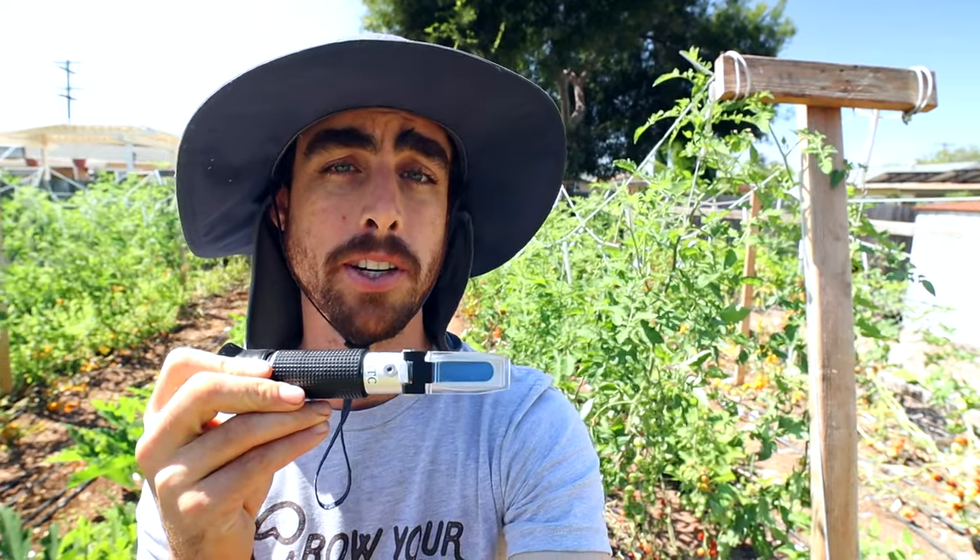Hey everybody, welcome back to another Nature's Always Right episode. Today I'm going to show you how you can test the amount of nutrients in your food with a really simple and cheap device called a Brix meter.